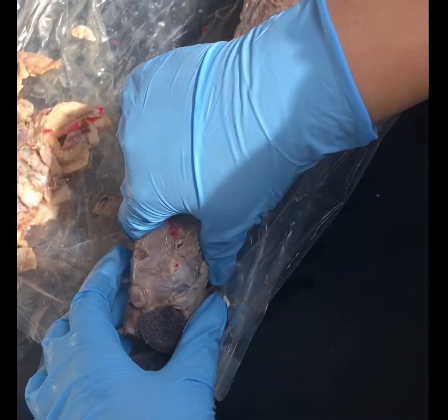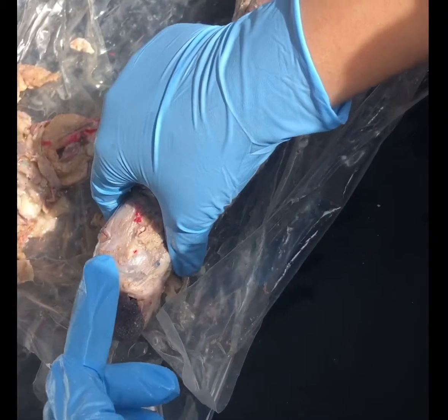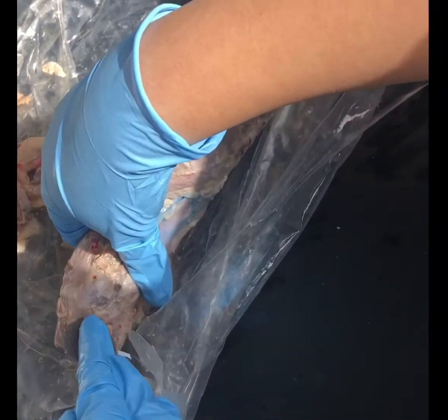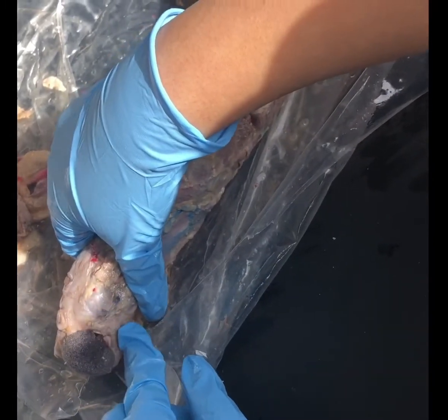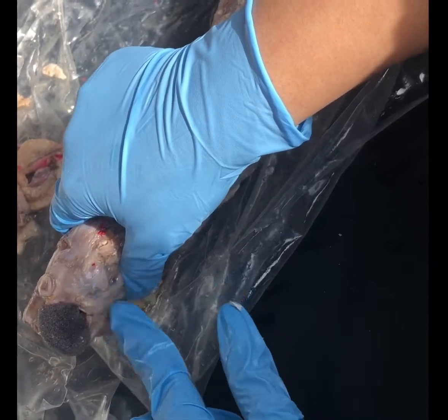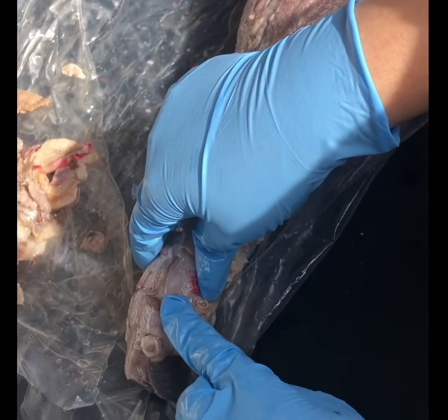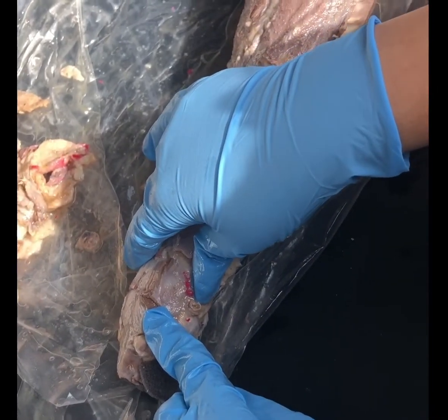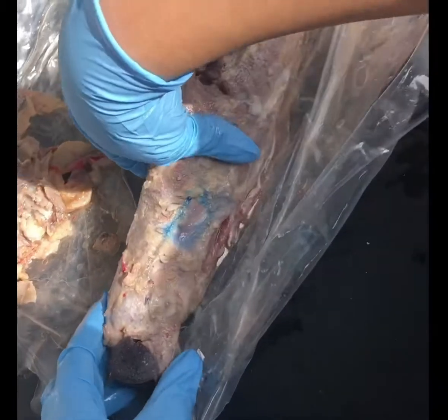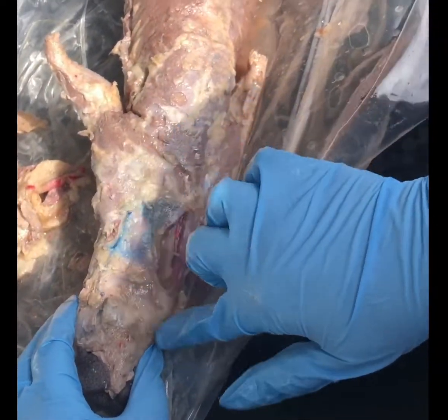The buccinator is the cheek, so his cheek is like right here. The masseter is also part of the jaw. It closes the jaw, so the jaw's right here, so it should be like around here. The temporalis is the temple, so the temple is right here. The platysma, which is the thin skin of the neck, would be around here, the neck area.